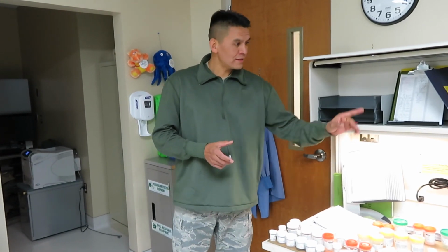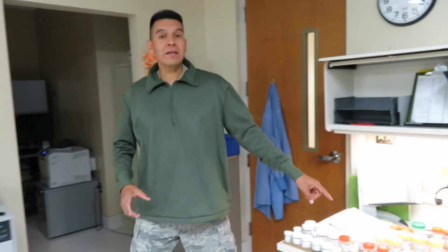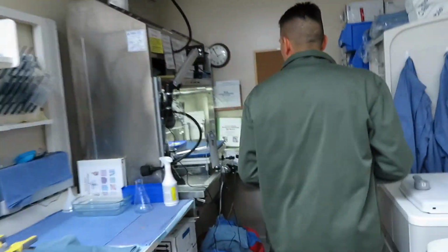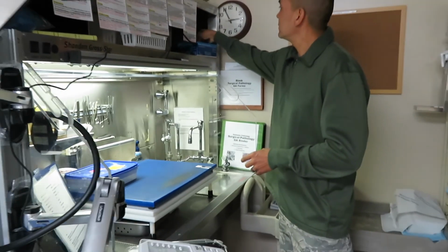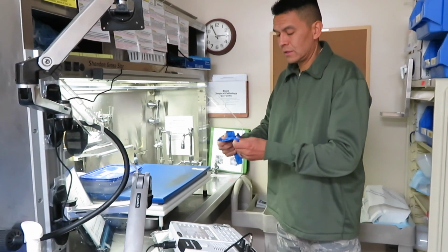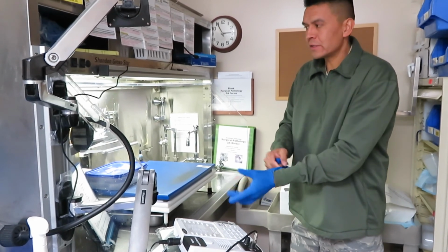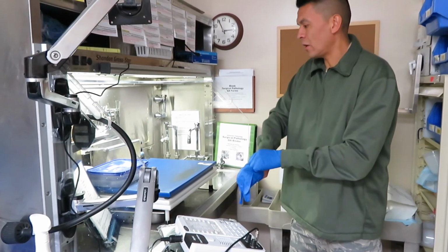Anyways, then what we do is they accession it into the computer, so it's in our system, and then we bring this container over to our grossing table. And here in the grossing table, we got to wear our PPEs, the protective equipment, goggles, gown, and whatnot. And then what we do with those containers is we open them up.